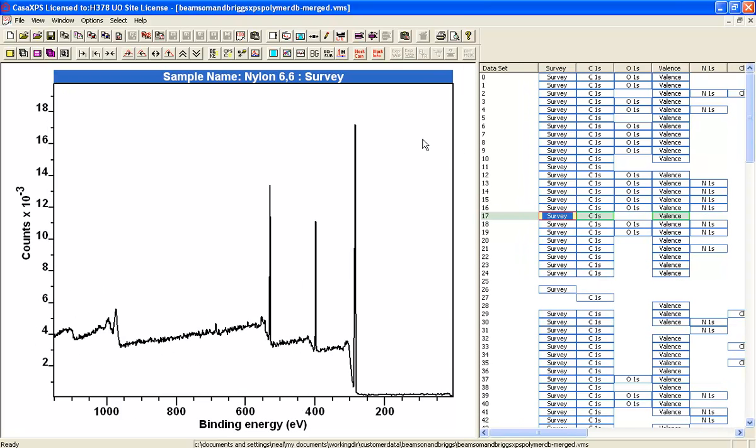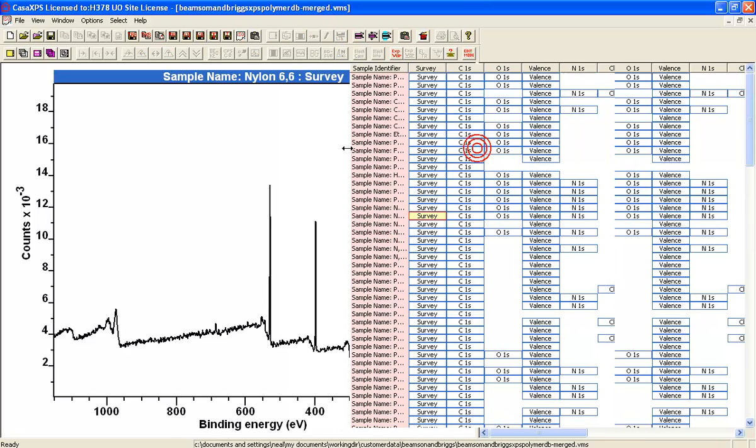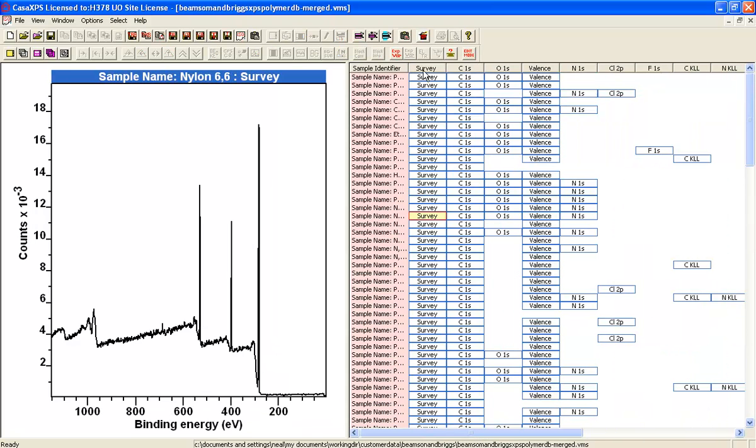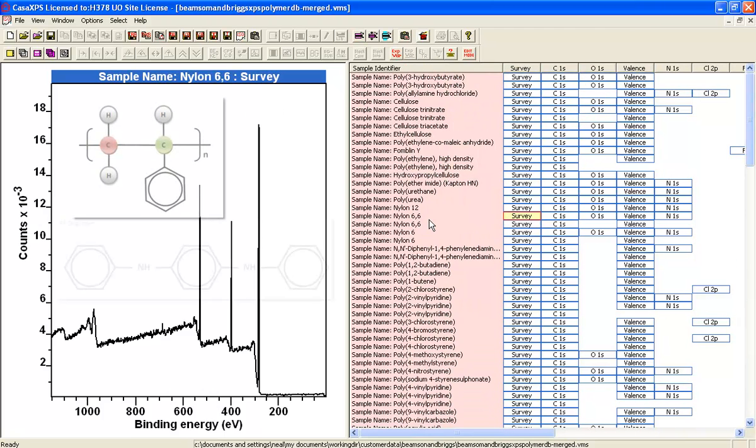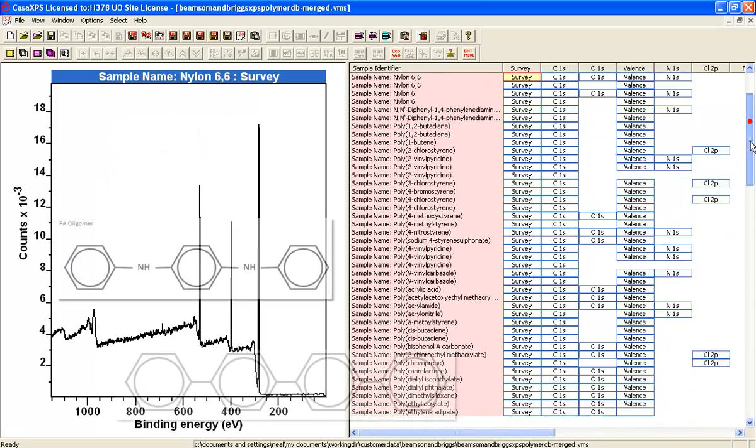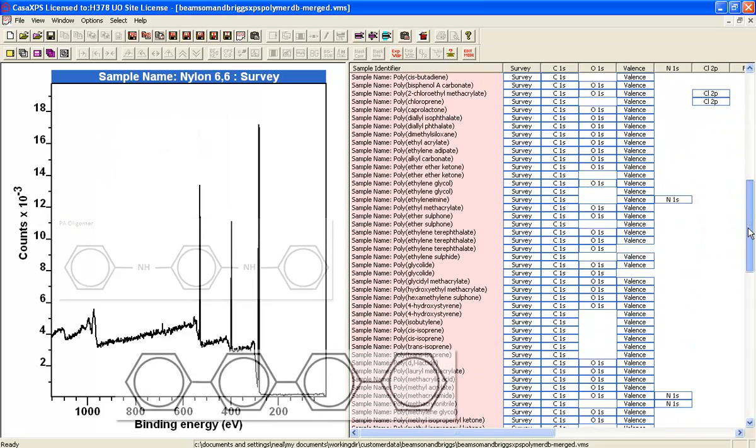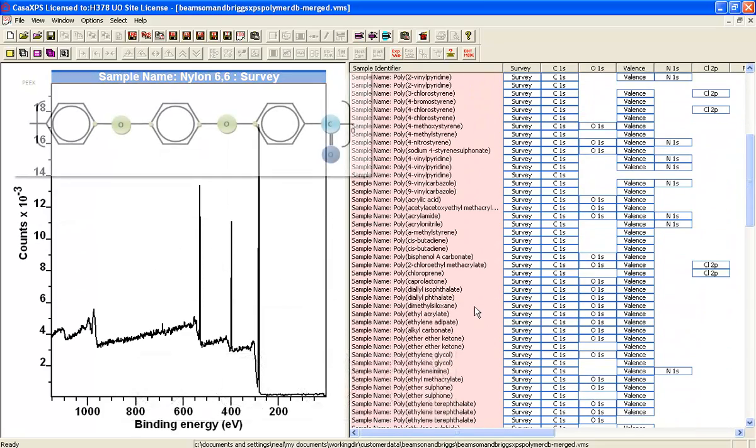Now I could also use the edit mode and the edit mode gives me another string or actually the same string is now being displayed here. So I could scan down the data visually by looking at the names for the polymers.